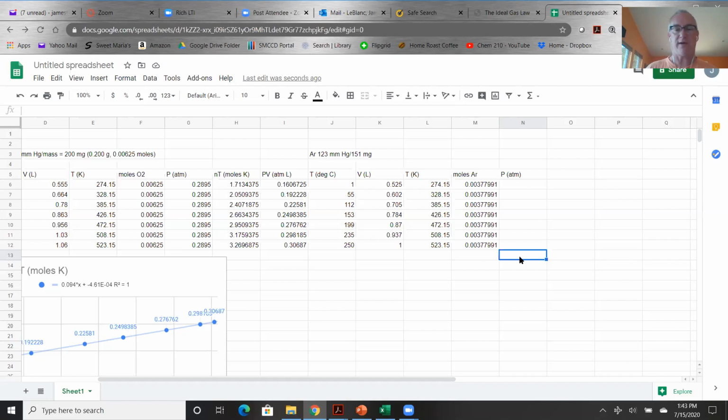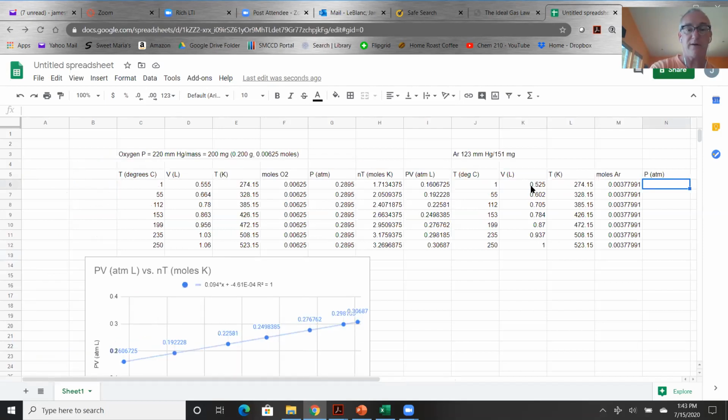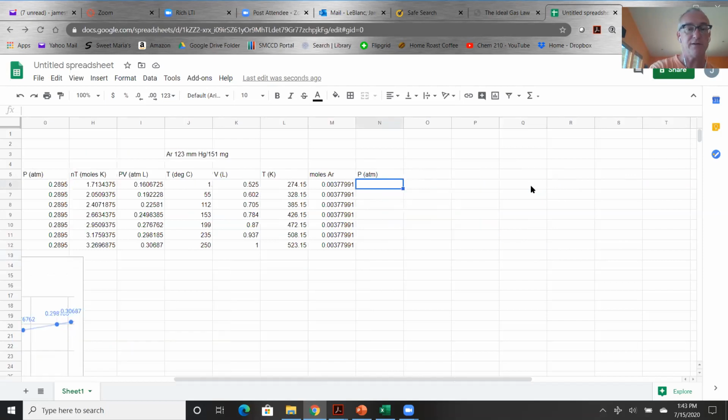You are perfect. Yes. What's my pressure? Isn't it the same? No, last time we did it, it was 220 millimeters of mercury. Now it's 123. So it's a different pressure. What's our new pressure?